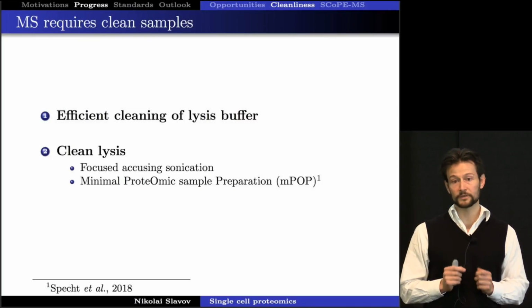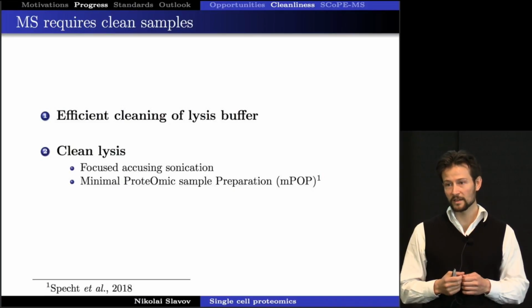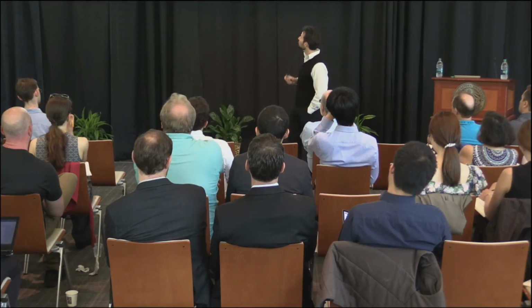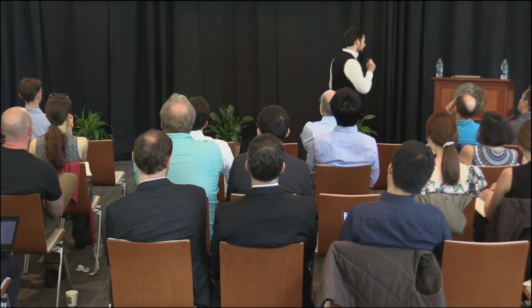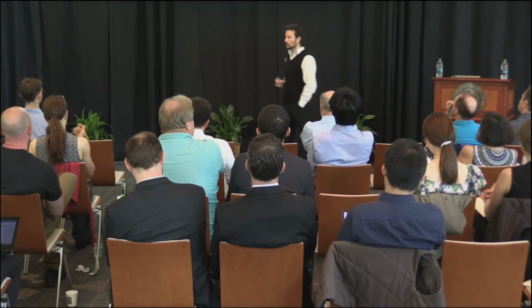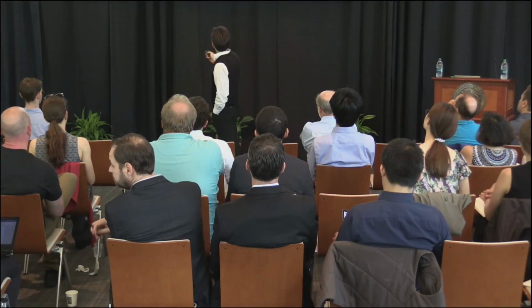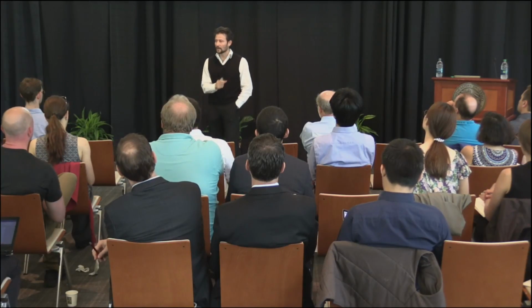Lysing cells in pure water is great because you don't have anything to clean. This thing is very, very low throughput. I would have never gotten useful data from that if it wasn't for Ezra Levy. He did heroic work with that machine to process hundreds and hundreds of single cells that I couldn't have done. So after that experience, it was clear to me that focused acoustic sonication, at least in its current reincarnation, is not the way to go to get to the 50,000 cells. So we focused on developing another method.